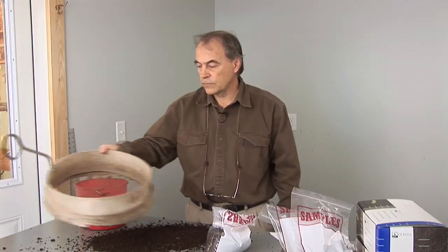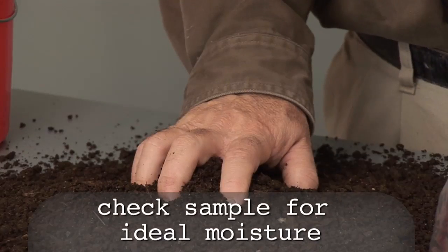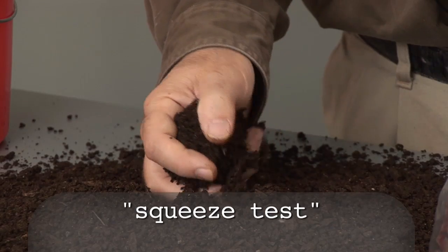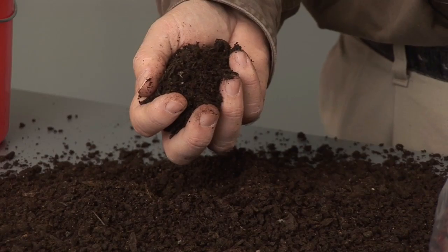The ideal state of moisture for doing a Solvita test is the same as the optimal level for composting. Let's perform a test for ideal moisture level. This is called the squeeze test and it's performed by hand. It actually works very well to determine optimal moisture, almost as well as a lab test.